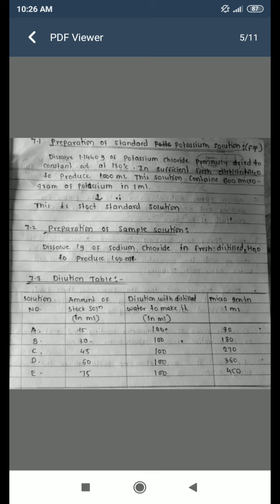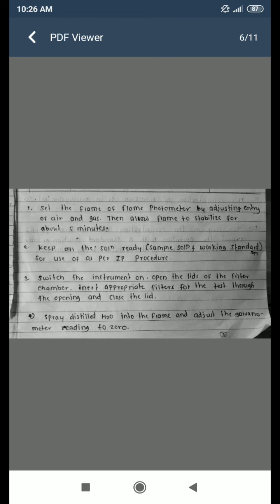Set the flame of the flame photometer by adjusting the entry of air and gas. Allow the flame to stabilize for about five minutes. Keep all solutions ready — the sample solution and working standard solutions. Switch the instrument on, open the lid of the filter chamber, insert the appropriate filter for the test through the opening, and close the lid.